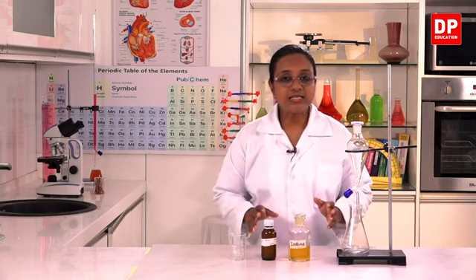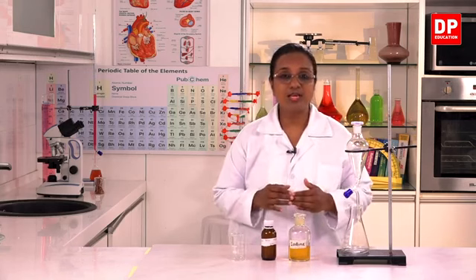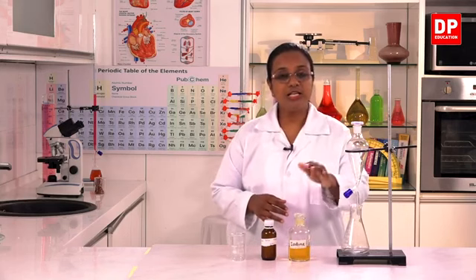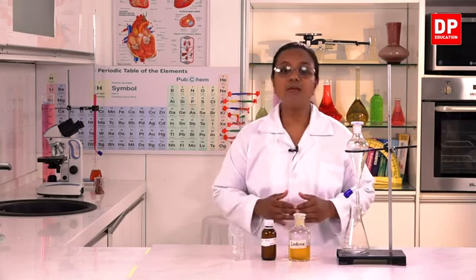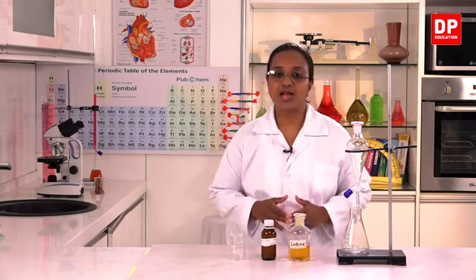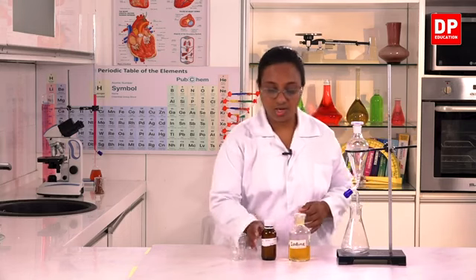So, in this we have to take two solvents that do not mix with each other. And also the solubility of iodine is somewhat less in water and it is more in carbon tetrachloride. So, that is how we are going to extract the iodine from water into carbon tetrachloride.